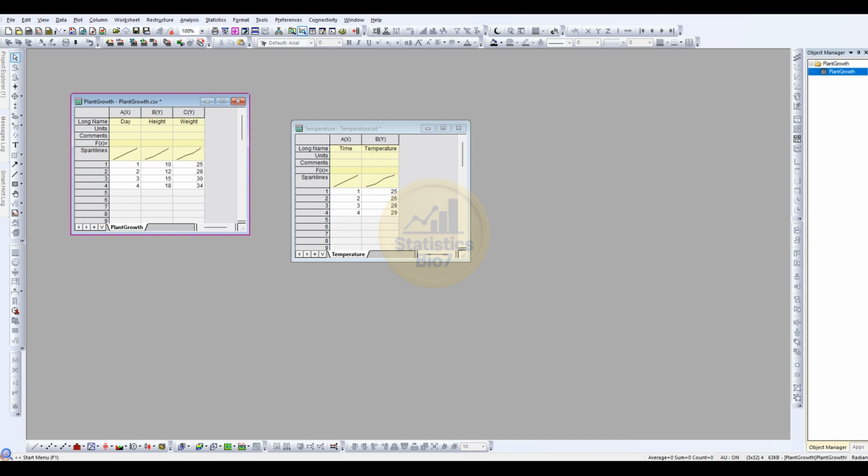The solution is to select the correct delimiter: comma, tab, semicolon, etc. Another is numbers imported as text. The solution is to clean the data before importing. Another is missing headings: ensure the first row contains the column names. Another is blank rows imported: remove unnecessary empty rows from the source file.